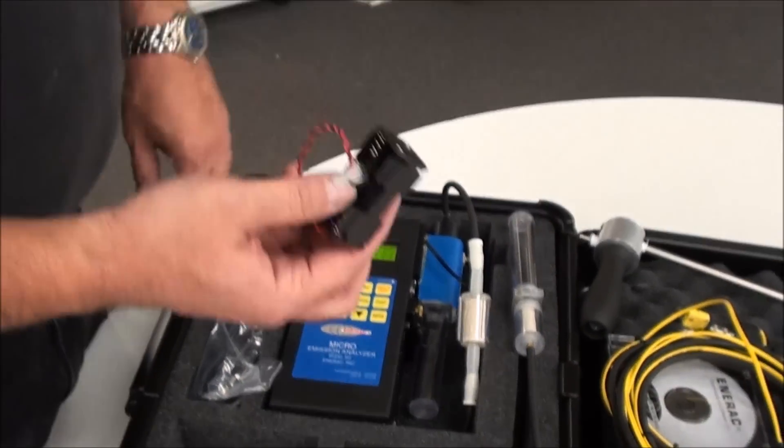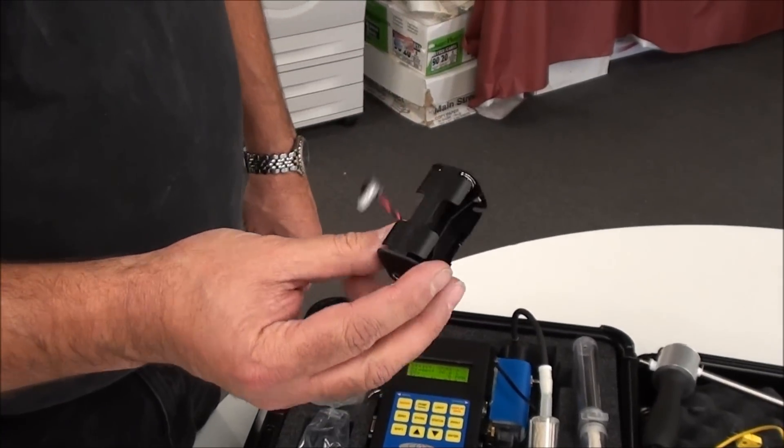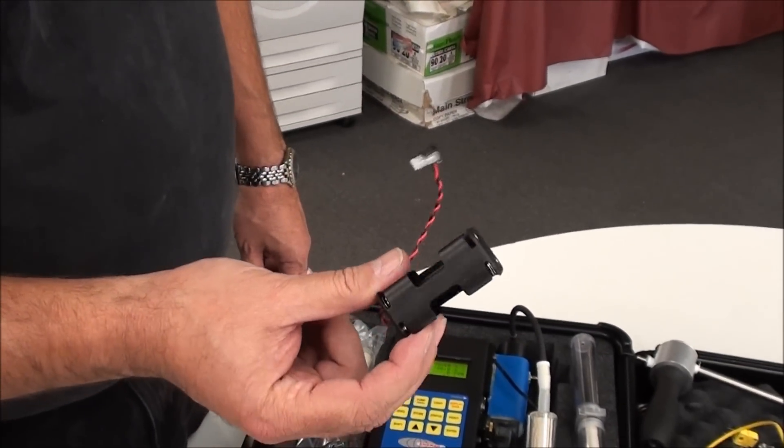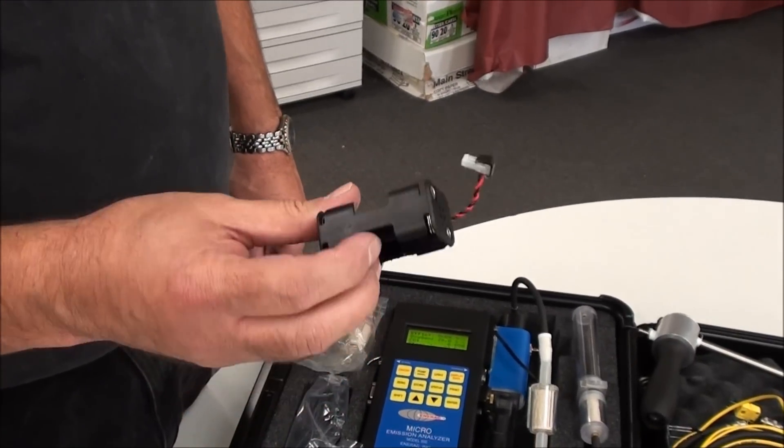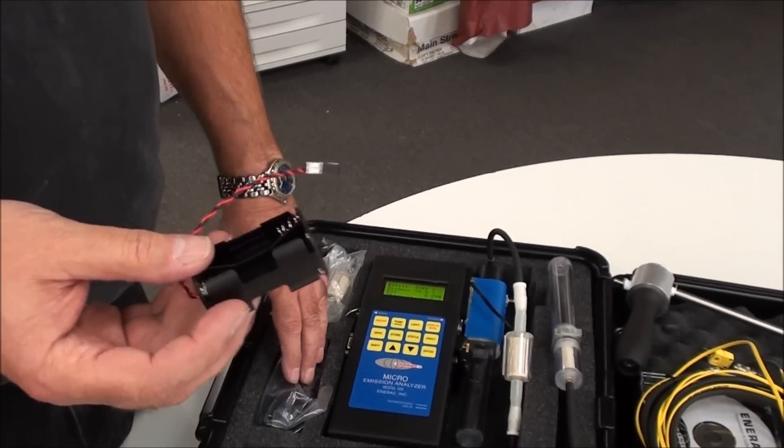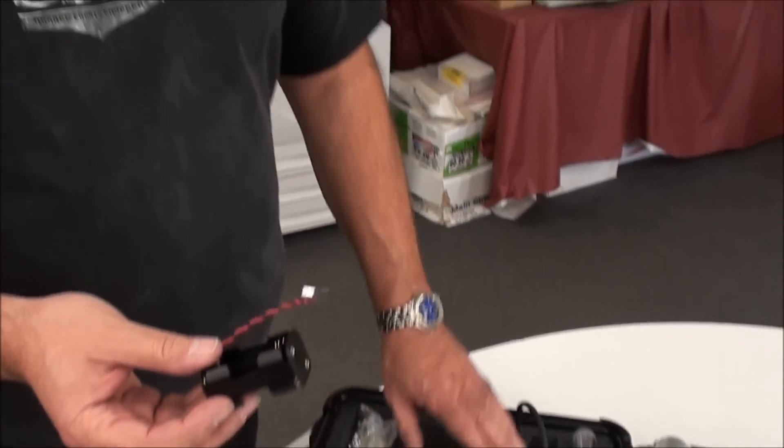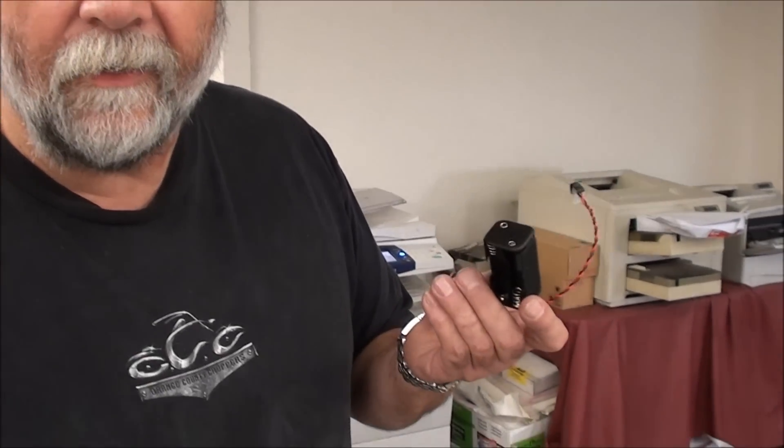You also get a 4-cell, 4AA-cell battery holder. In the event that you're in the field and you don't have power available to operate the unit on the rechargeable batteries, what you'll do is install four alkaline batteries into the holder, and you can continue your testing.